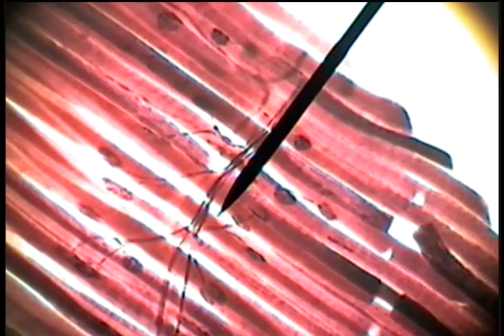The tissue shown here from the nervous system is skeletal muscle. This is the skeletal muscle nucleus of the cell, located on the exterior, and these are long parallel skeletal muscle fibers with cross striations.